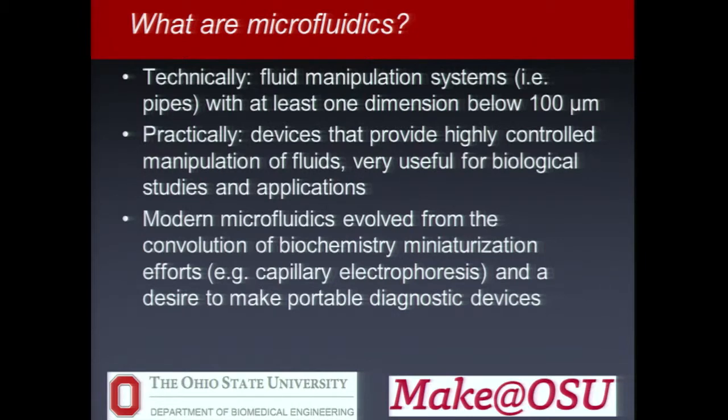And if we think about where the field of microfluidics has come from, it's really been kind of coming from both ends. Clinical chemistry started seeing that miniaturization led to a lot of advantages in terms of the physics of increasing resolution of their separation processes, while at the same time there's a lot of push from defense industry, from the health industry at looking at can we make healthcare and diagnostics much more portable.